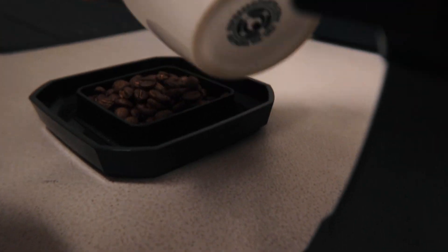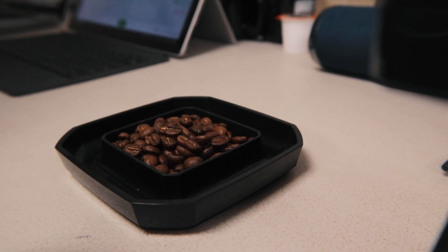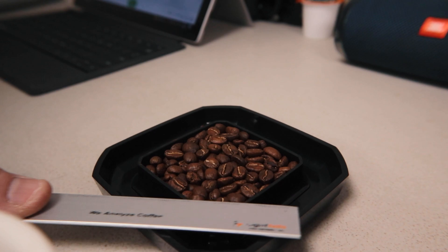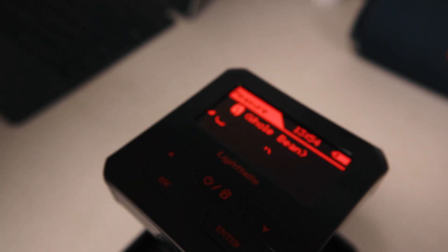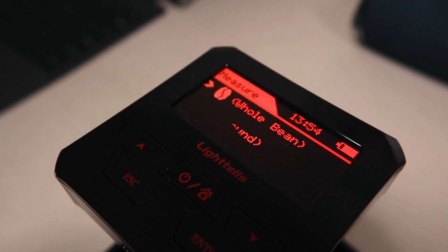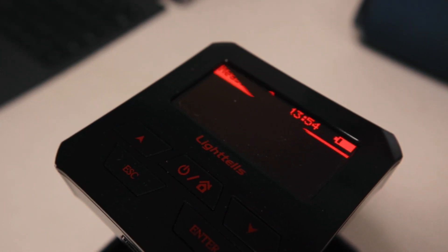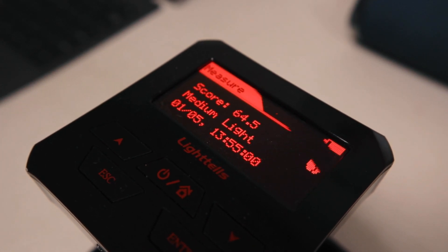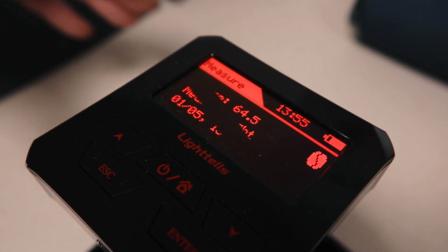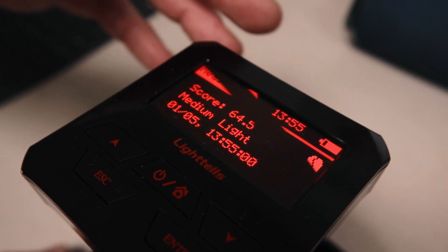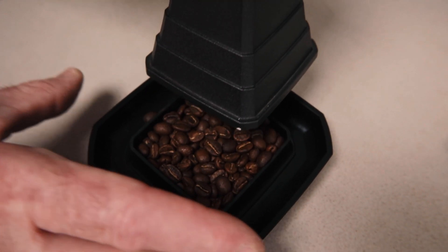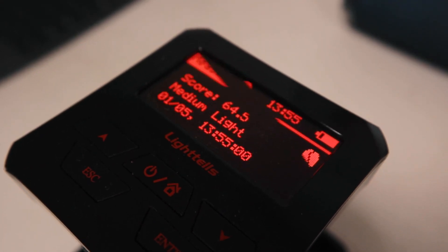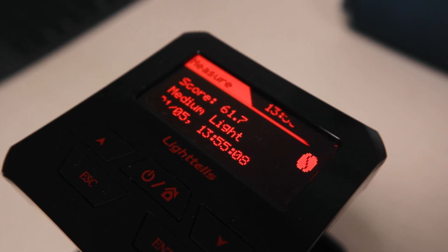So this is super simple to do. Level it out. We're going to hit measure, enter, go up to whole bean. Boom. So we got 64.5, which this is a light roast, so I wasn't too surprised with that. We're going to jostle it around and say about 63 average.